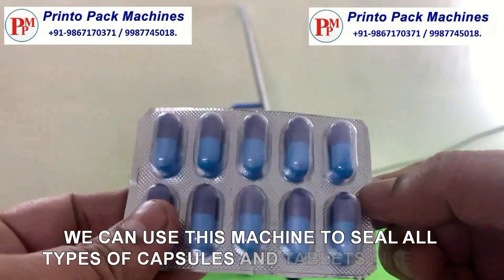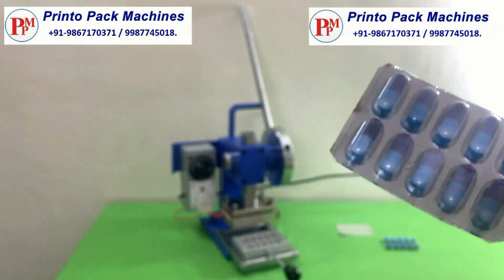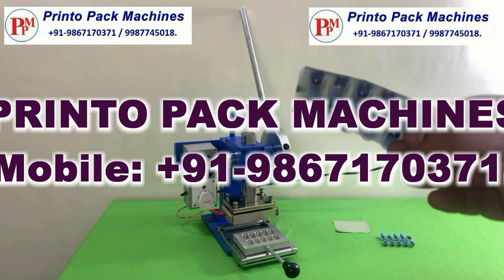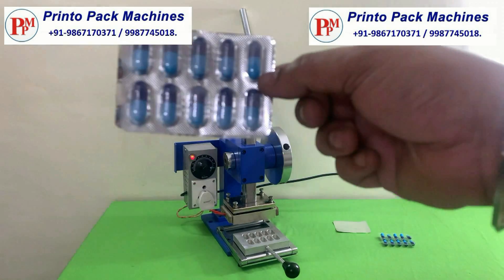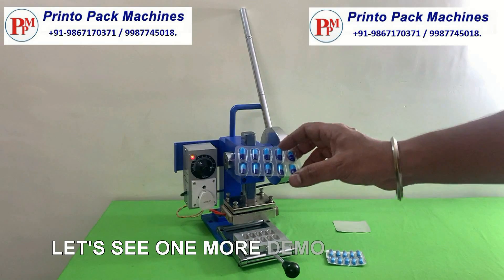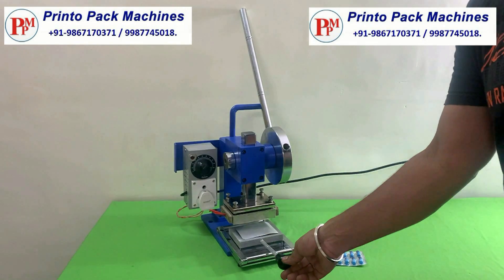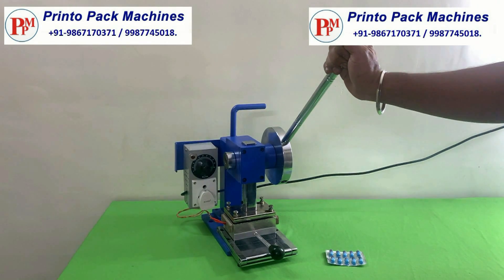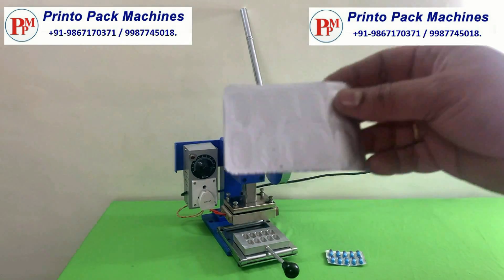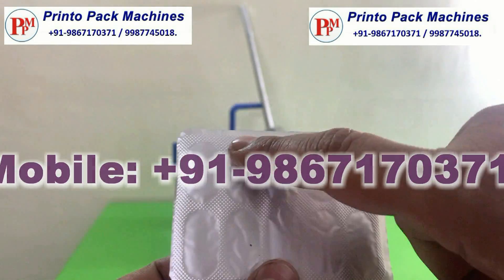We can use this machine to seal all types of capsules and tablets like this. Let's see one more demo of sealing.